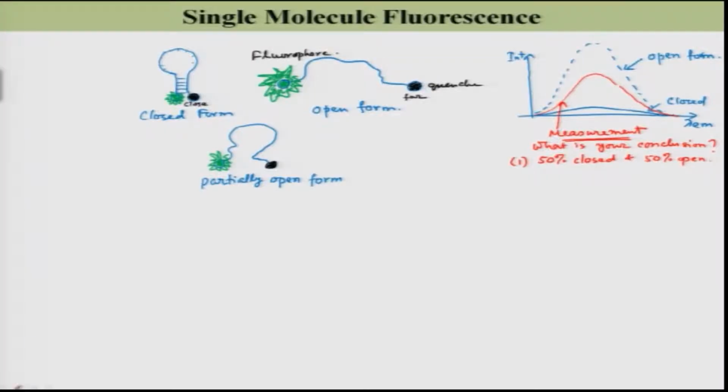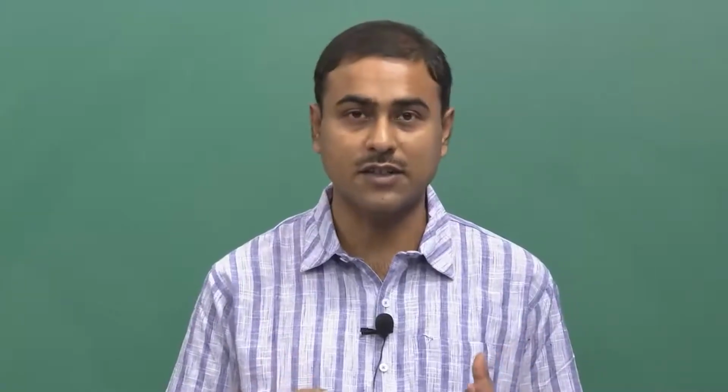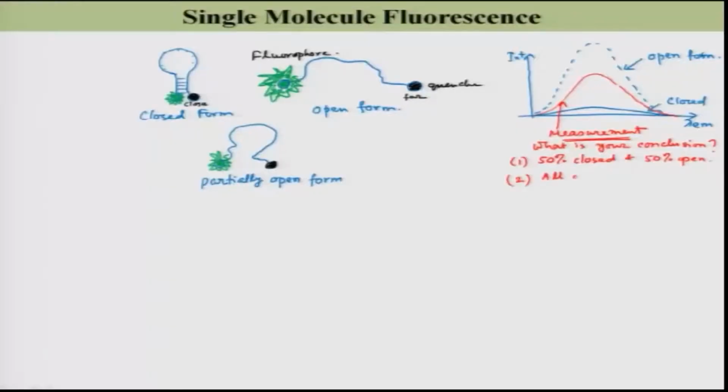So the second option could be that all these molecules under investigation, you have a certain concentration, but all of them are present in a partially open form.